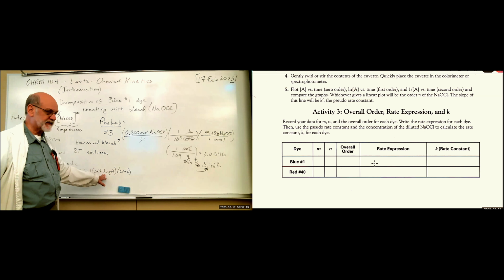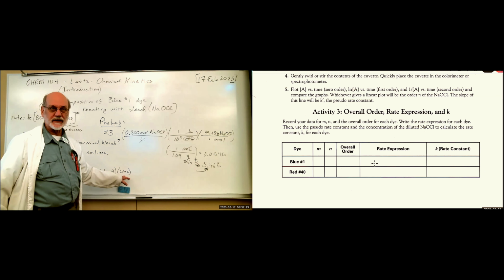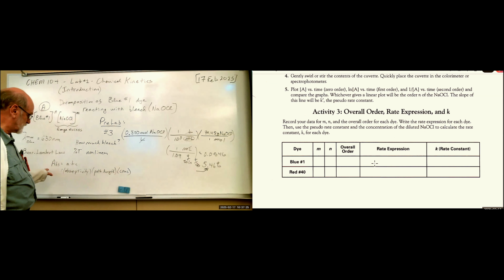Okay. Now, since absorptivity is not going to change because we're measuring the same molecule and the path length is constant, then absorbance varies with concentration directly. That's why we can use absorbance.